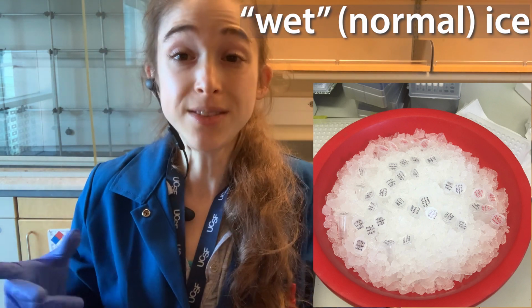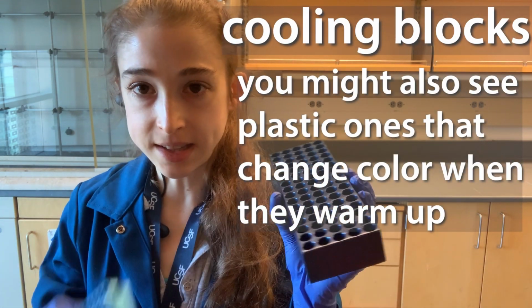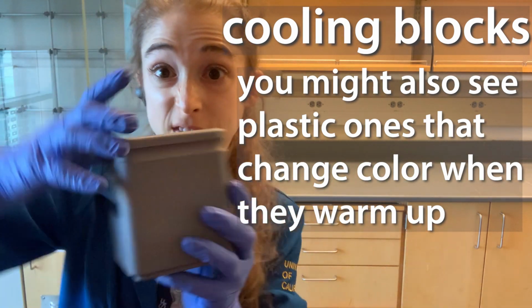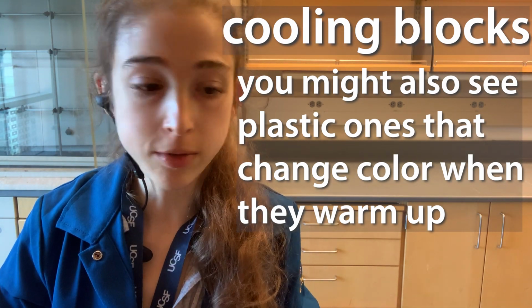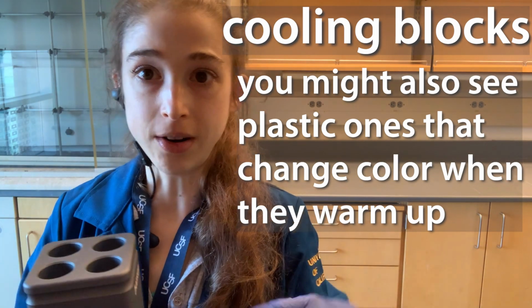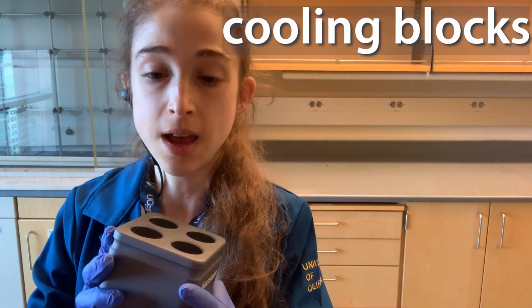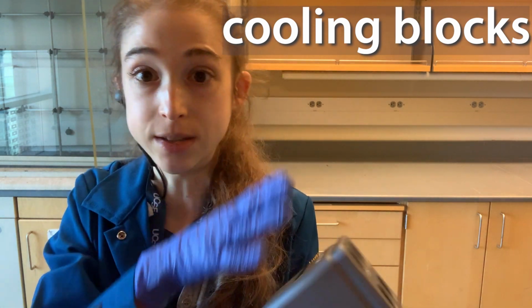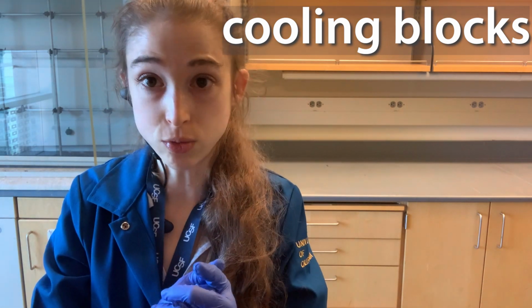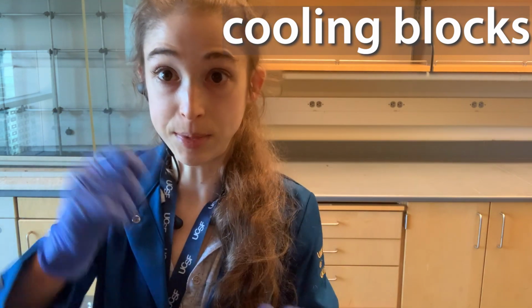I didn't even know about these until I got here, but they make these cool racks, which are metal blocks, and they come in different sizes with different size holes depending on your tube size. They even make ones for 50 ml tubes, and these are really helpful because they get cold really quickly and they actually stay cold, so you can take them out, pour out your ice, get fresh ice, or go put them in the fridge and they'll stay cold. And they keep your tubes in place, which is super helpful when you're trying to keep things organized and keep track of what goes where. You can also cap and uncap tubes really quickly.